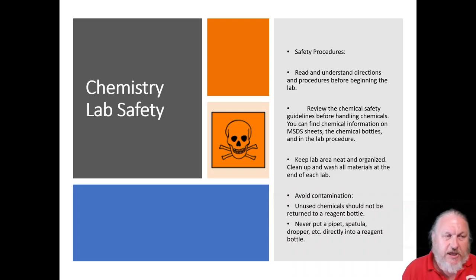Some more chemical lab safety. Read and understand the directions and the procedures before you begin each lab. Review the chemical safety guidelines before you handle the chemicals, and you can find these on the SDS, the chemical bottles, and then the lab procedure. Before you handle a chemical, I'm going to let you know about it. Keep your lab area neat and organized. Clean up and wash all your materials at the end of each lab before you wash your hands. Avoid contamination. Unused chemicals should not be returned to the jar. I will have enough for you laid out so we don't waste material. You never want to put things into a reagent bottle. Don't put a pipette, a spatula, or dropper in because that can contaminate the material.